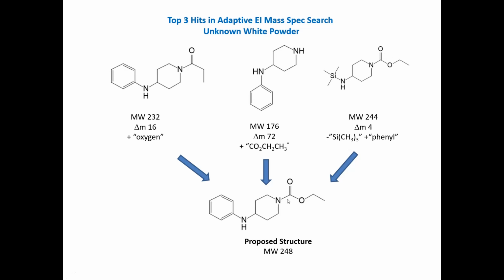Of course, in EI mass spectrometry data, one cannot tell exactly whether the position might be on this NH here as opposed to this NH here, but from some of the fragmentation data and from the fact that it did line up across with the 3 proposed, we went with the proposed structure with the carboethoxy group on the carbamate being at this location.